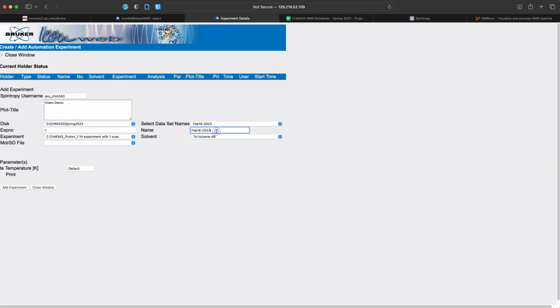And then most importantly, a name. So we're going to call this, I always start with the date, 2023. This is February 16th. And again, the sample is ACAC in toluene. And for completeness, I'll just say video demo, so that we could identify that sample.